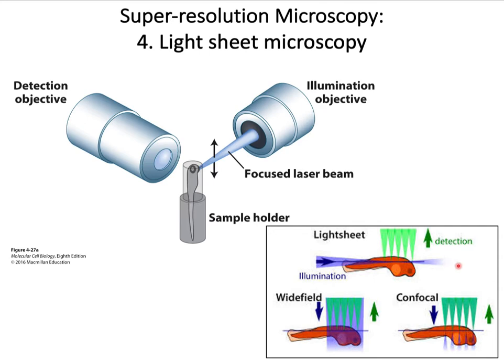You can think of it as a CT scan or MRI scan imaging of a patient where the sampling of the tissue is done in sectional planes. The same way, in this light sheet microscopy, a plane of the sample is illuminated and each point on the plane can emit a fluorescence emission spectra to the detector. The plane of the laser illumination or light sheet is changed very rapidly through the sample, so the fluorescence emission spectra from each plane is collected to give an overall 3D image of a rapid dynamic event throughout the depth of the sample.